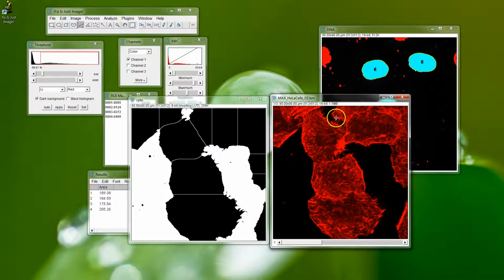So for the ones up here, it's not done a great job of splitting things out. There's a lot of overlap, and clearly there's one cell here, and it's got these cells across here that look like some northern states with straight lines, and so it's not done a great job. When we go to cell profile, you'll see it does a much better job.